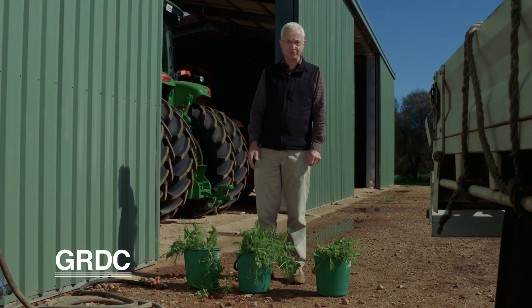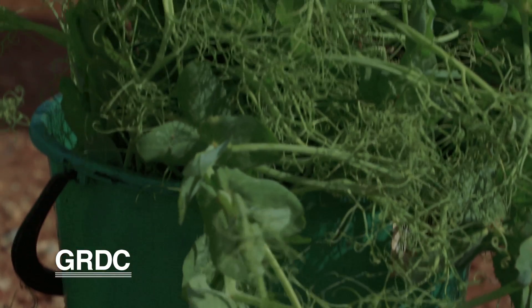We have our three buckets of peas back from the paddock. What we're going to do here is add water to those buckets, let them soak for a few minutes, then we're going to carefully wash the root systems and divide them into two different groups: adequate nodulation or not adequate nodulation. Then we'll work out the percentage of adequate nodulation.